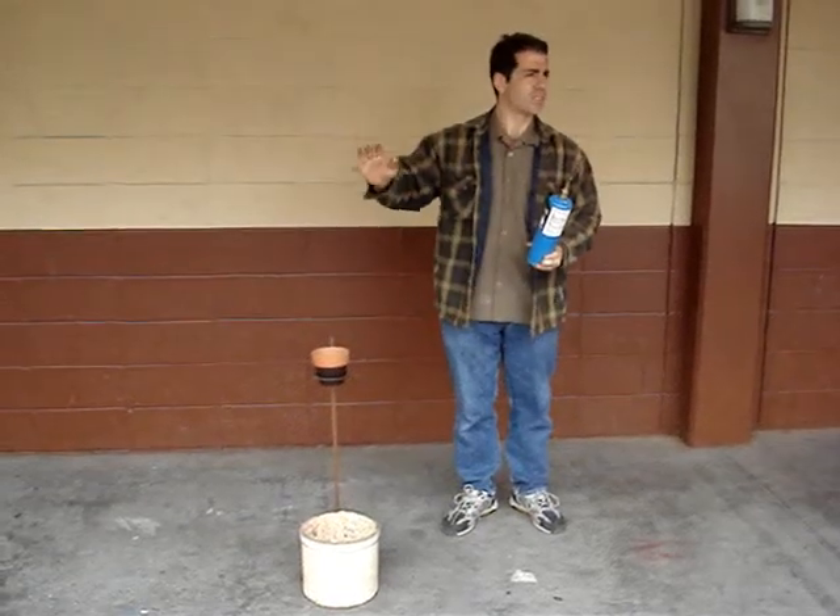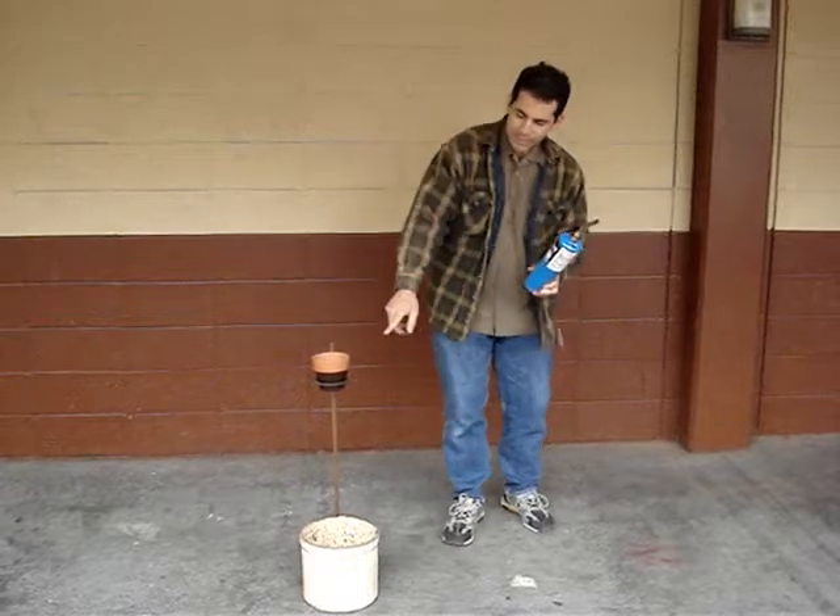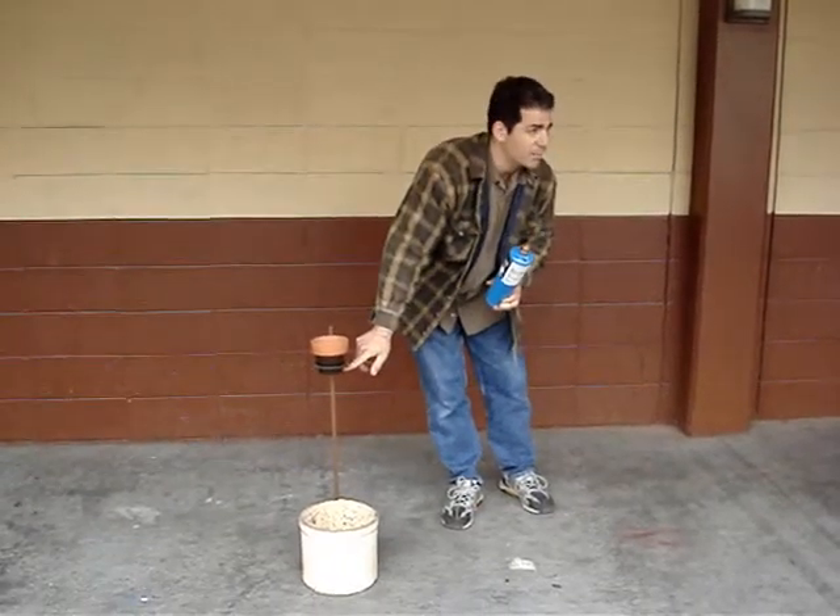Lots of heat, lots of sparks, lots of fire coming out of the top. But what's going to happen when the molten iron hits the paper?